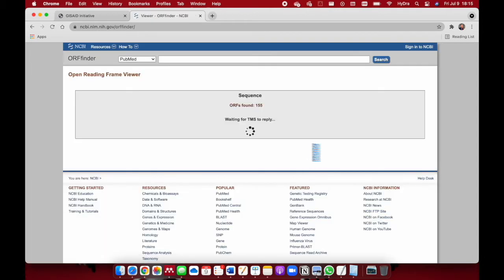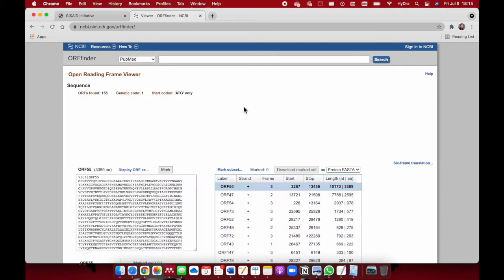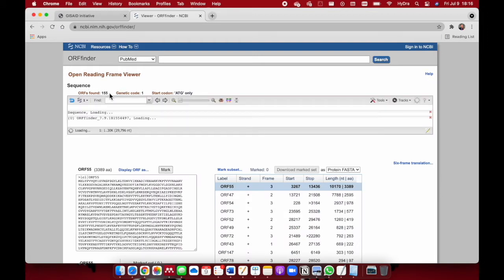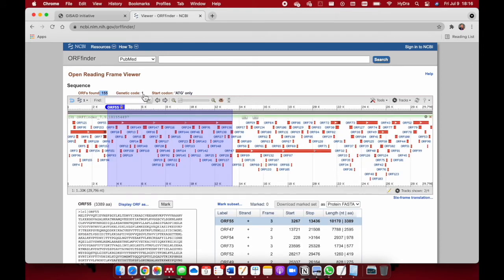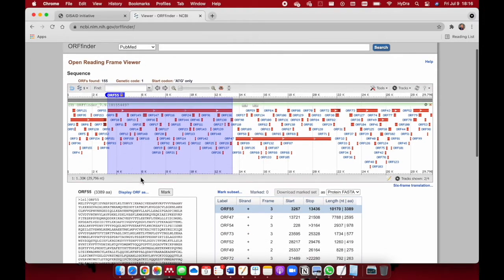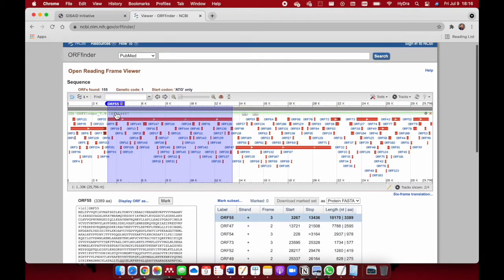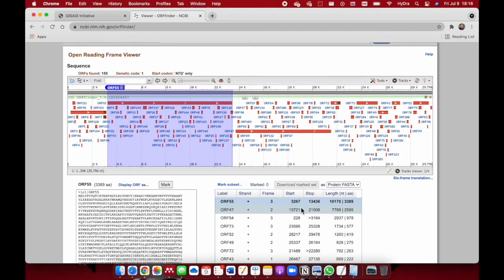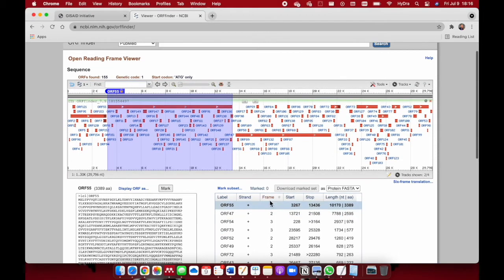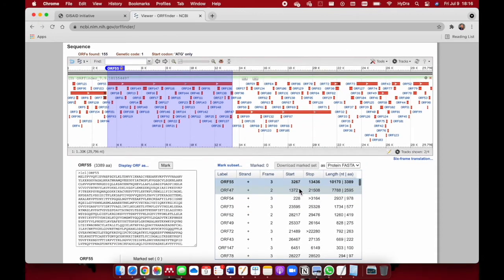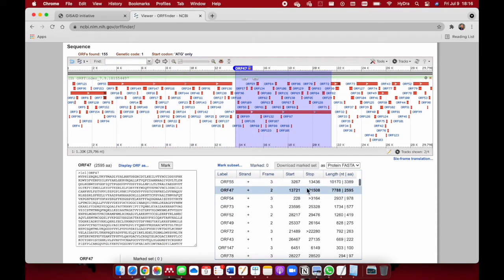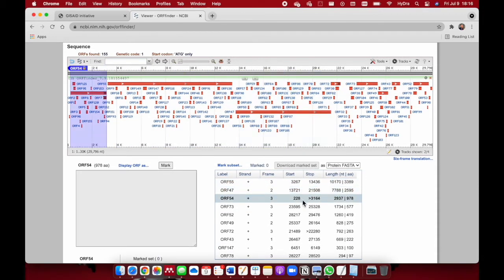It's loading. Currently 155 open reading frames are found with genetic code 1 and start codon ATG only. Our first open reading frame highlighted is open reading frame 55. How do you know the highlighting? It's because the highlighted frame is 3. If I select down here, it will shift and so on.